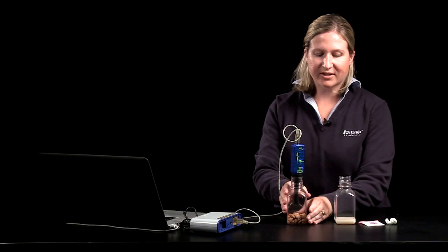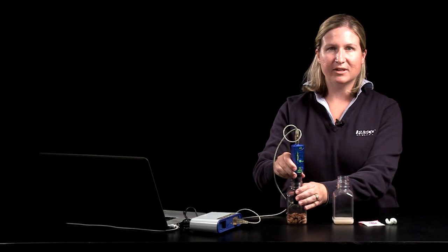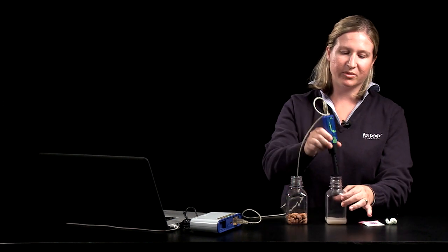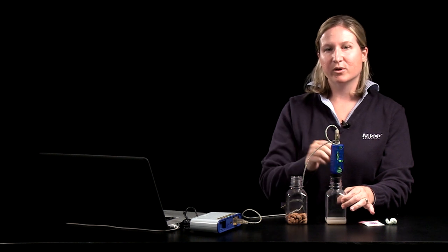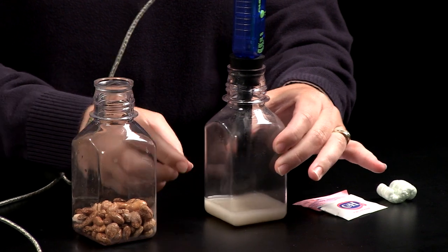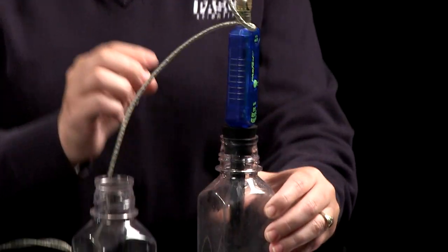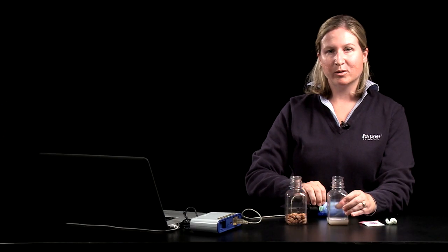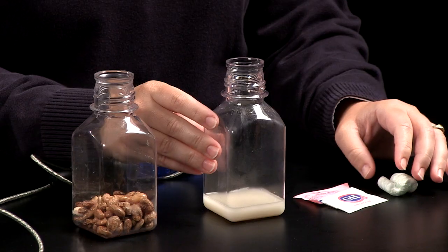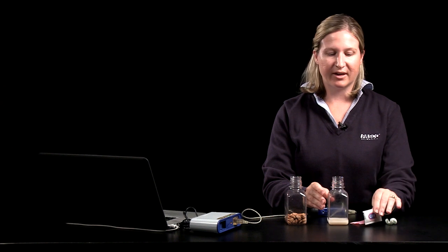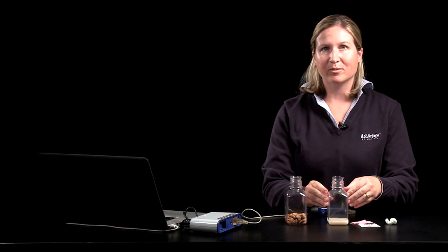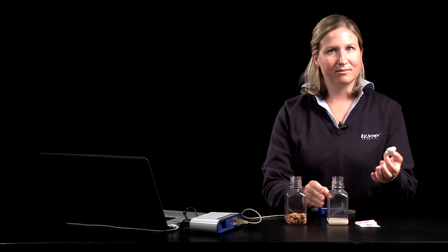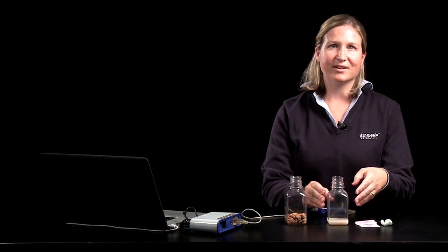You can also investigate respiration with a solution of yeast. Again you would just put a small amount of solution in the bottle. You can plug that bottle with the CO2 sensor. It is important to not allow the CO2 sensor to get wet so you want to make sure that the volume of your bottle does not reach the end of the probe there. So students can look at the amount of carbon dioxide produced by yeast either through respiration or fermentation when given different sources of energy. So you can first give the students sugar and have them see that yeast do utilize sugar for energy by producing carbon dioxide. You can then give them artificial sweetener or some starch pellets and you can have them investigate what other carbohydrates yeast might use for cellular respiration.